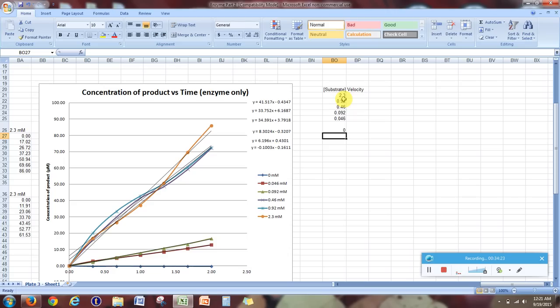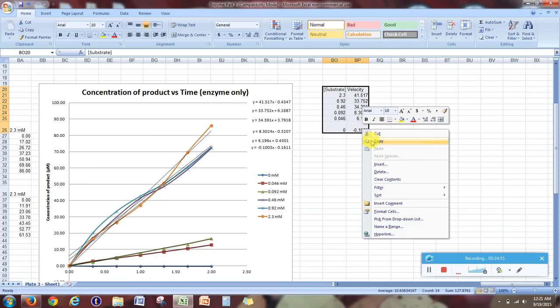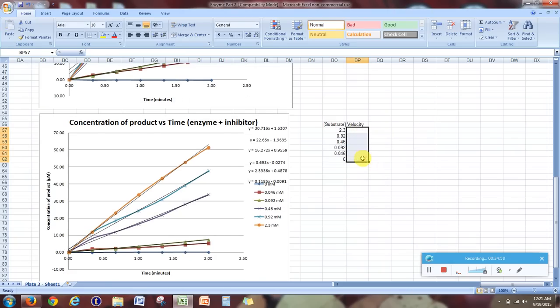and now we need to pair up, type in the velocities, making sure we're pairing them up correctly. So this 41 goes first. And if you get one that's negative, that's okay, just copy it just as it is. And let's go ahead and do this down here as well. I'll go ahead and just copy this whole thing and I'll change the values. These are obviously going to be different. So again, starting with that 30 value and working my way down. And obviously your numbers are going to be different, but I'm just trying to show you how it's done.